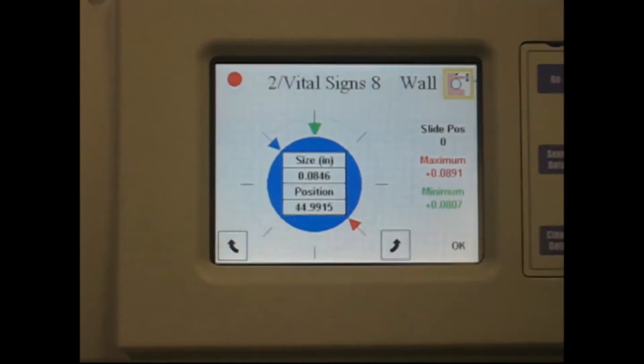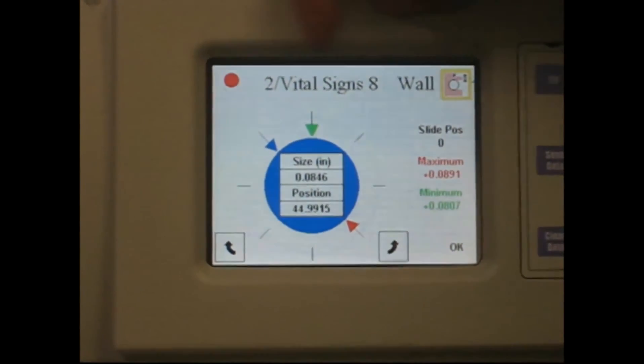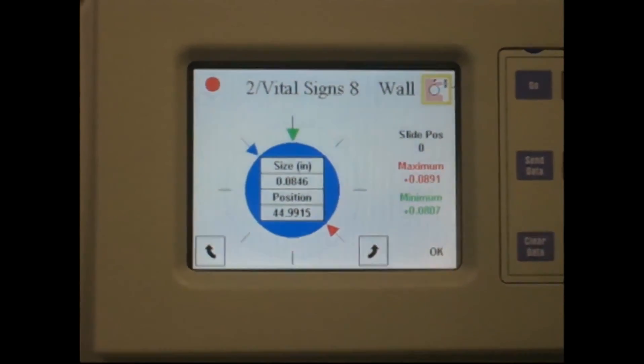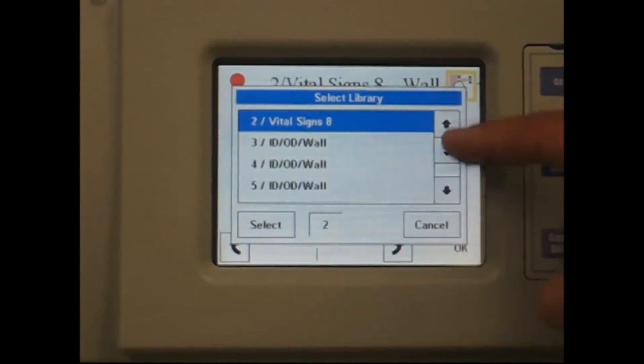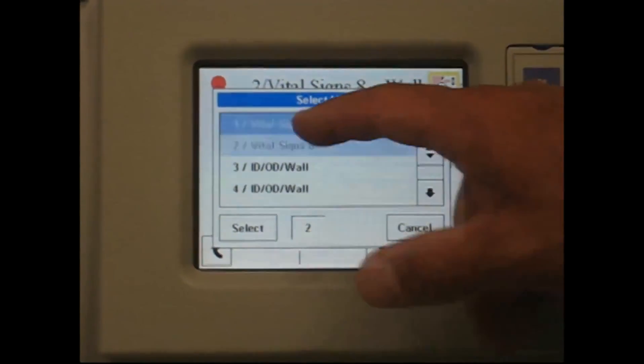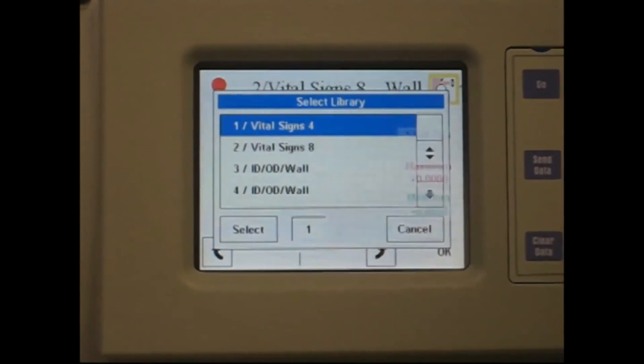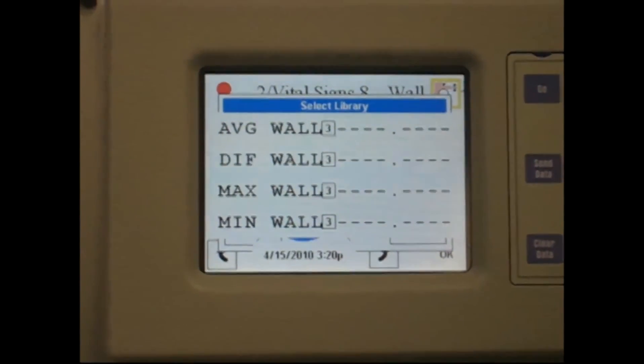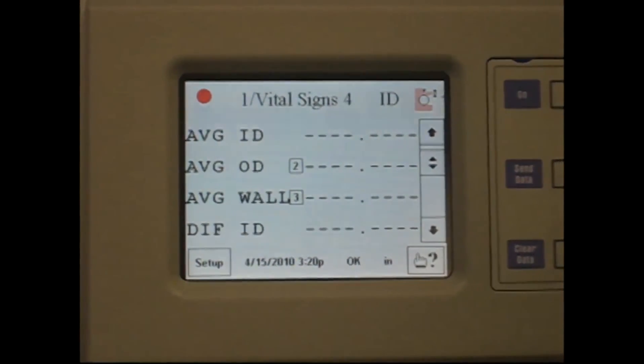You can see here that we're in library number two, it's shown on the top of the screen. Press the bar, use the up, down arrow, library one, select, and it will indicate the top of the screen there it's changed.